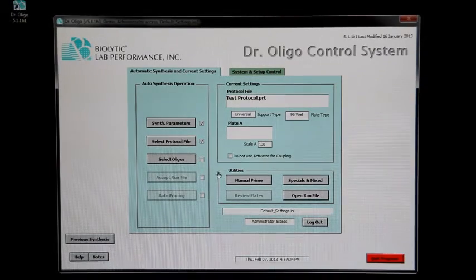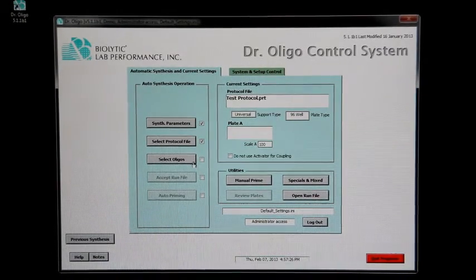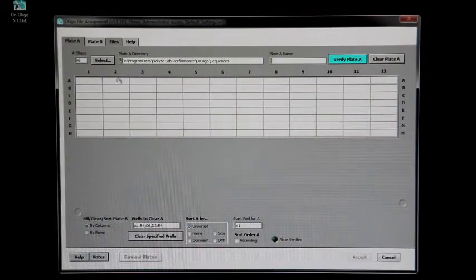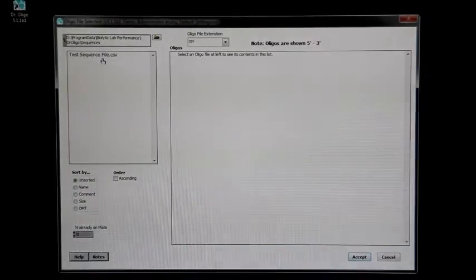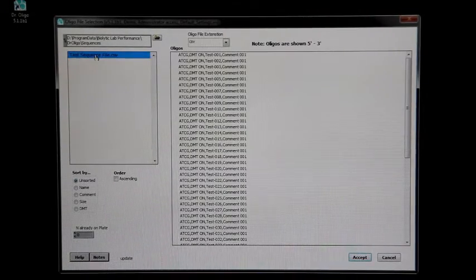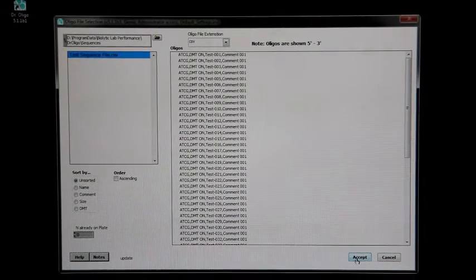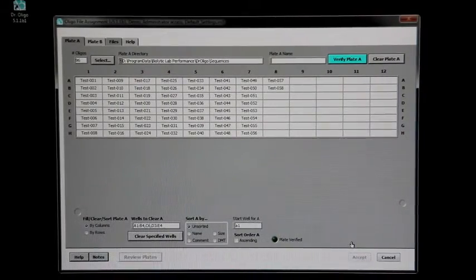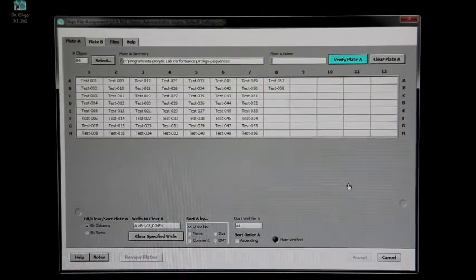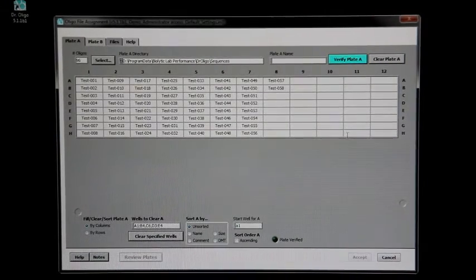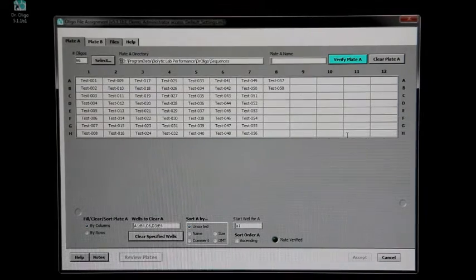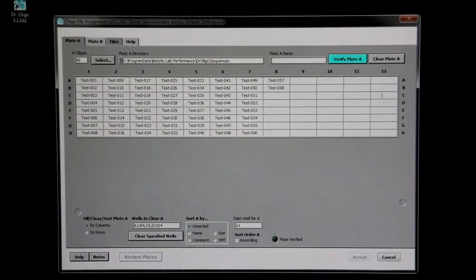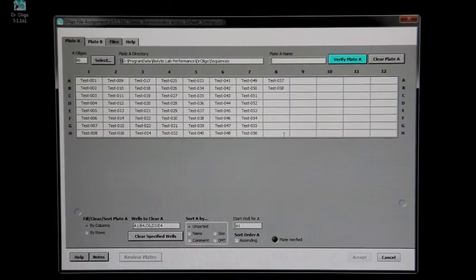To select the oligo sequences to be used, click select oligos. Click select to find the oligo sequence file and click accept. Note that only 58 oligos are being synthesized in this plate. It is possible to synthesize fewer than 96 oligos. However, if you do this, the unused positions in the reaction plate must be filled with plugs.